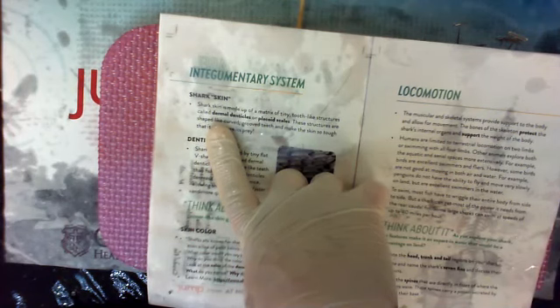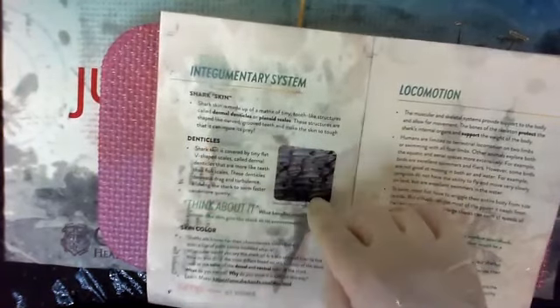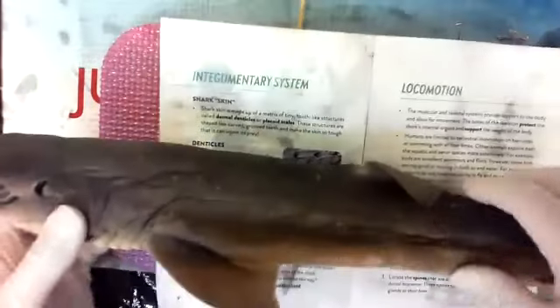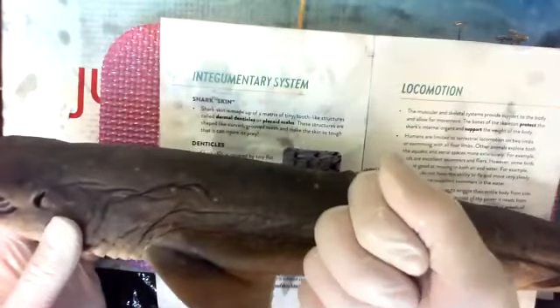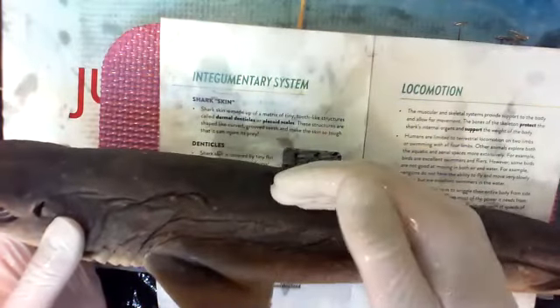Dentists, right? What do they work on? Teeth. Denticles are actually teeth. They're little teeth-like structures that cover the shark. So I think of medieval knights and their chain mail. You know, it was a series of rings so that if they got hit sideways with the sword, it was blocked. It wouldn't cut them. It would hurt like crazy, but it wouldn't cut them because of the protective armor.